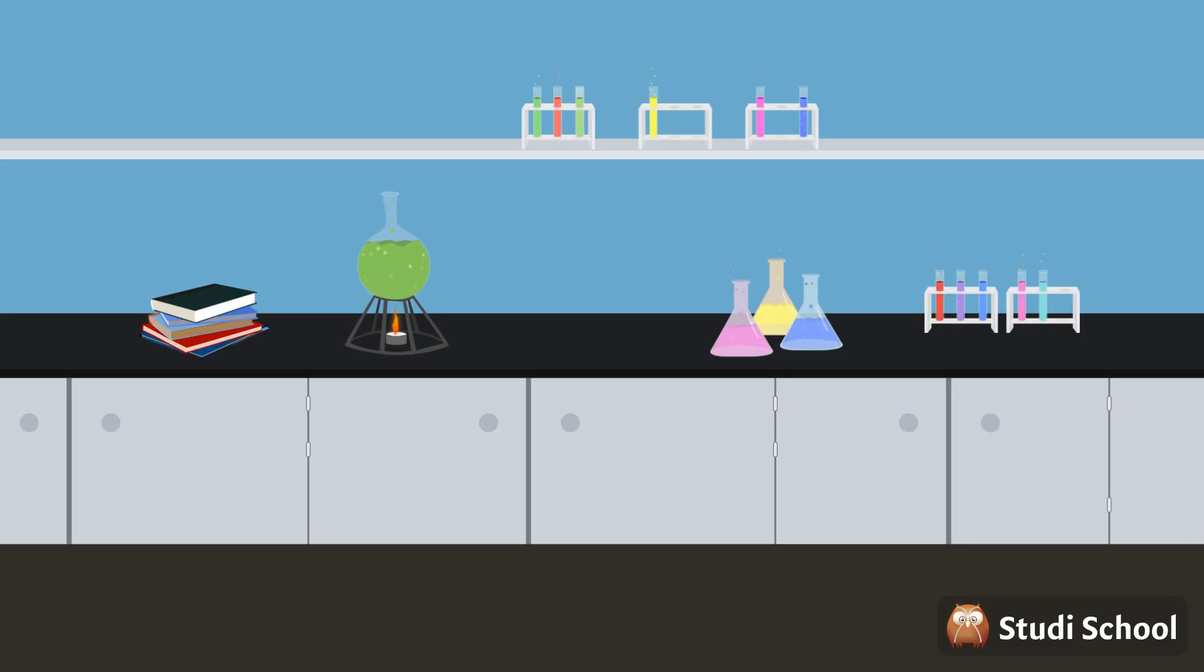A laboratory is a room that is specifically designed for conducting experiments in a safe and efficient way. Let's look at what we will find in a biology laboratory. The tools used in laboratories are called apparatus. They can be classified into different categories.